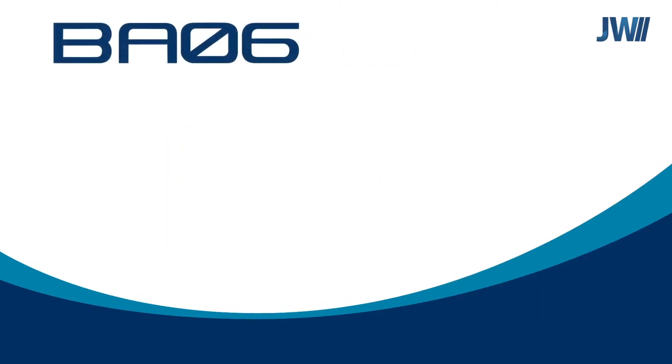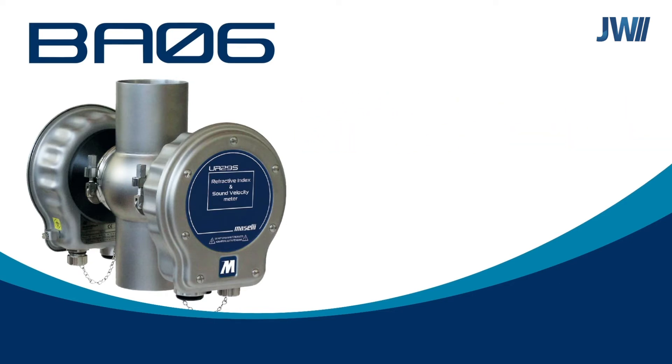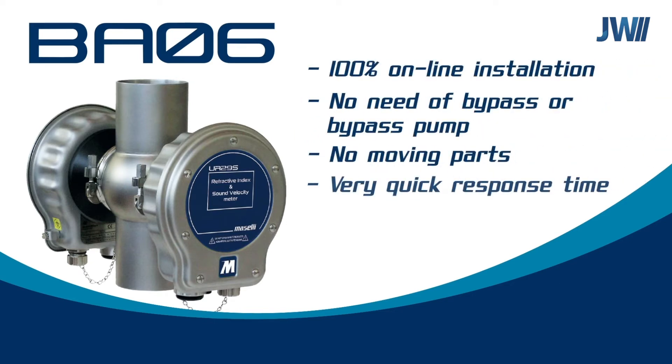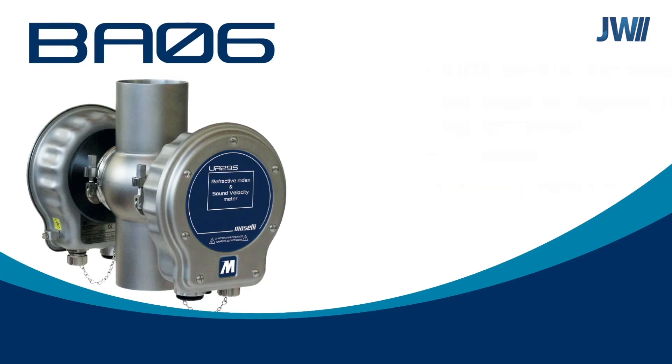Our BA06 analyzer incorporates the UR29S in combination with the UC09 infrared CO2 analyzer. With this combination, we can measure parameters such as Brix, alcohol, CO2 and O2, for example, along with other analysis modules that can be added to the system.